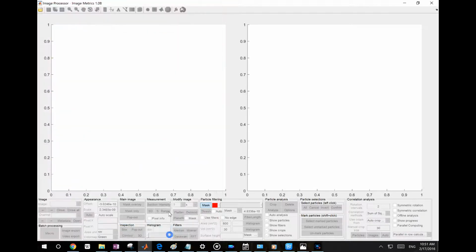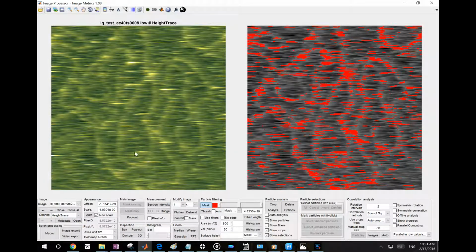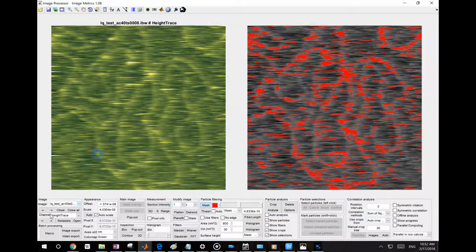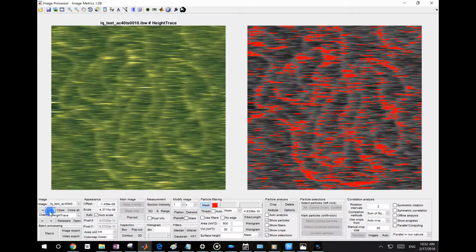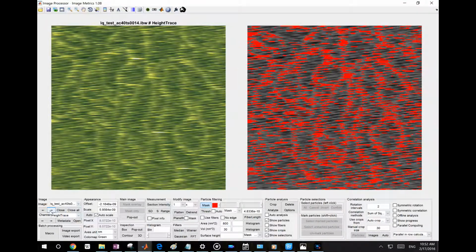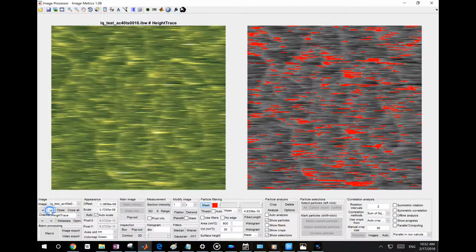So these are taken in solution DNA sample, and they used fast scanning. You see that image quality is not very good because it scans very fast, but you can get a lot of images at the same time. So what I'm trying to show you here is, so this is the height. You see there's a lot of noise, and I try to see if correlation averaging of all these images can improve the signal to noise ratio or not.